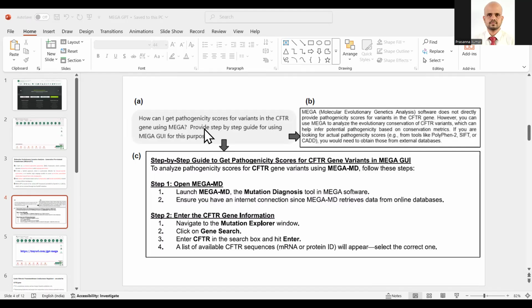So let's see. It's a neutral mutation. Here you can see the polymorphism phenotype, and the evolutionary diagnosis and SIFT value. It says neutral. If it is substituted by tryptophan, it will be a neutral mutation. Okay, so let's keep studying. Let me choose this site. It looks more parsimonious. Here again, I will go for tryptophan.